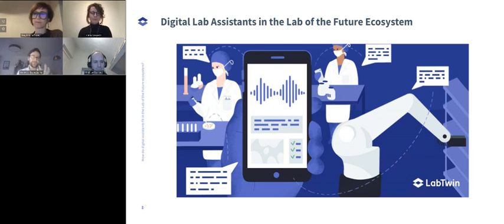Yeah, so that was the first point I want to make. And the second one, if it comes to metadata, because you can really gather a lot of metadata, the question is where to stop. Typically, I always use the guiding principle: think of the needle in the haystack. What type of metadata do you actually need to recover exactly a specific data set?